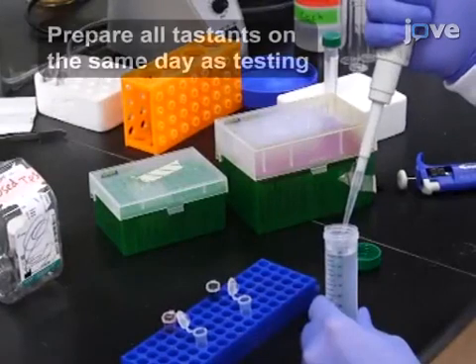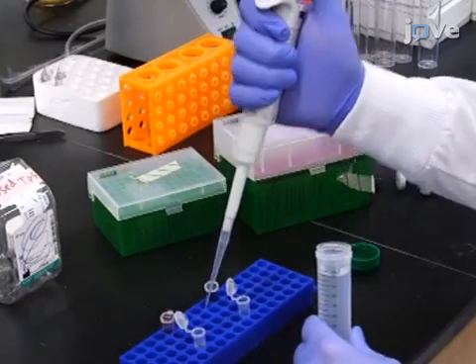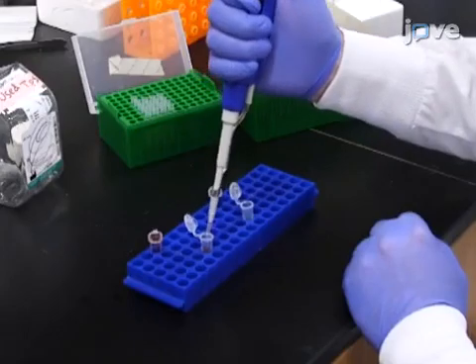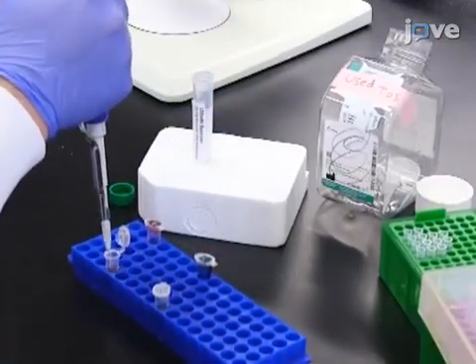Prepare the controlled tastant of 1 millimolar sucrose by combining 10 microliters of 100 millimolar sucrose solution, 13 microliters of red food coloring, and 977 microliters of water.